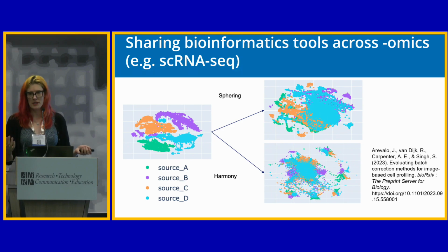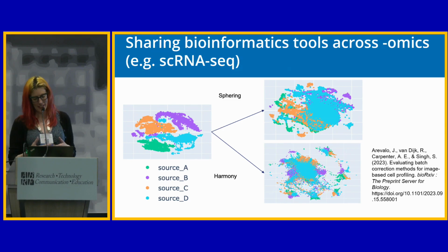So hopefully I've now convinced you what we do is cool. It has many applications, and I'm just going to go into now a few examples. Again, I don't have the time to tell you all the things I want to tell you, but one thing we are working on, sort of crossing omics, since that's the theme of this session, is using bioinformatics tools that have been developed in other omics, for example, for RNA-seq, tools that have been used for data set alignment or for batch correction. We are actively exploring how that can be applied to morphological profiling data.